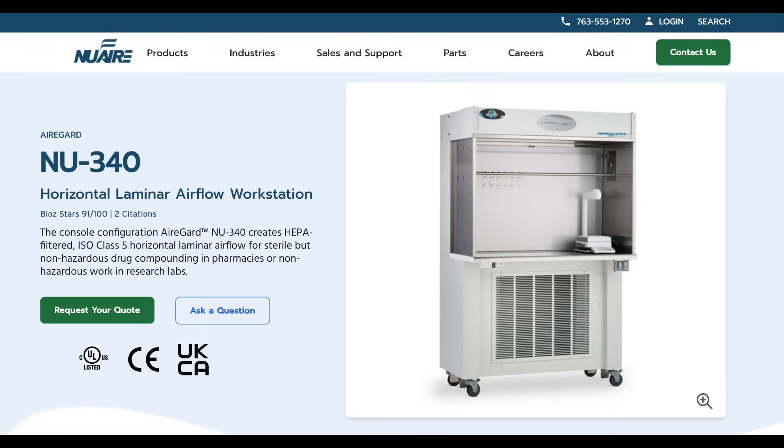It's probably the most important piece of equipment that I have. The model that I've been currently using is the NuAir Air Guard NU340. If you were to purchase this new, it would be like $5,000. Do not give NuAir your $5,000. Please, God.